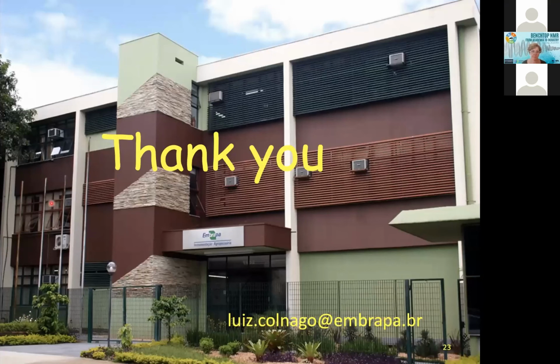And that's where we have our NMR labs, in one of our buildings: the high field or high resolution on this floor, and the low resolution or time domain NMR on this floor here. You are welcome if someone wants to visit our lab, because we not only apply but also develop specific applications and pulse sequences dedicated to specific analyses.